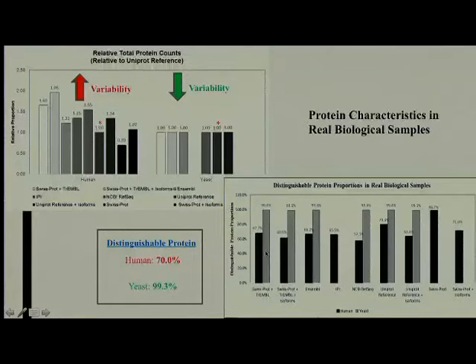These are proteins that are represented by a distinct set of peptides. Unlike the indistinguishable, where they're ambiguous. Right. If you were able to collapse multiple proteins into a single group, you called it a cluster in your earlier slide, would that be a distinguishable protein, or would it be eliminated?